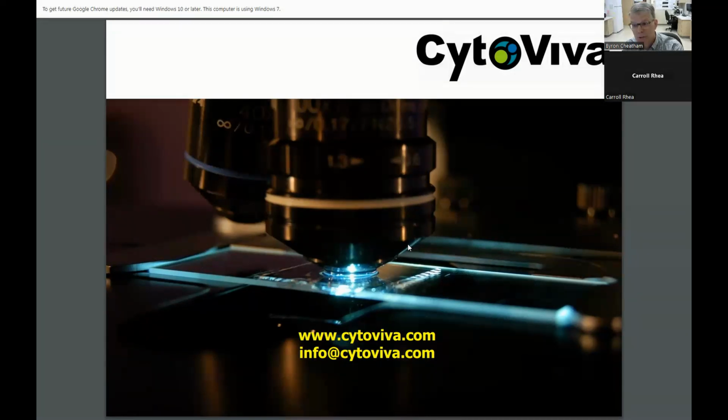And again, as I mentioned earlier, in the cell, depending on where a nanoparticle is in the cell, it's going to have different biocorona effects. And there are published papers where people have been able to reliably measure that in a way that was quite novel. Okay, thank you. From Gabriella, how do you prepare slides with live cells?